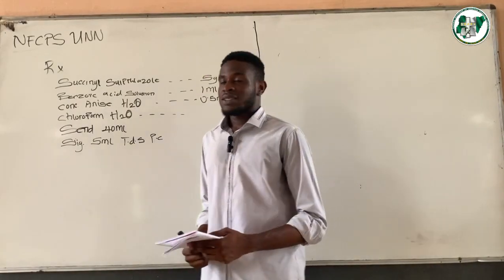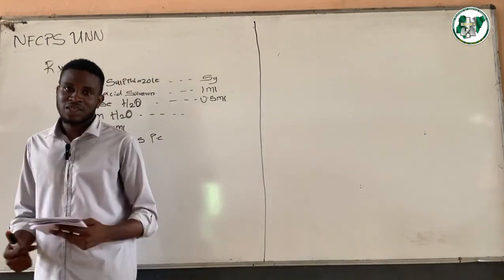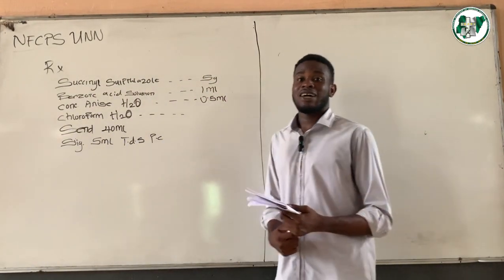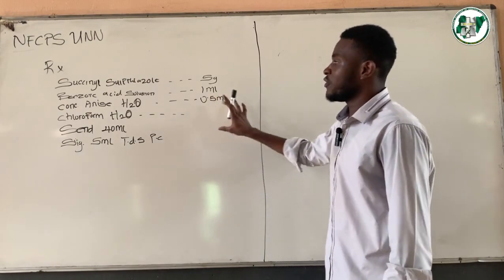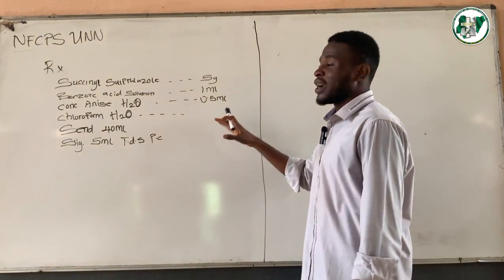Okay, over to this next question. Before going into it, I really want to bring to your attention that once you get to the lab, you will not necessarily have the luxury of time to be going over this as slowly as possible. If you look at this prescription, this is all you need for your label. You don't need the working formula after we might have solved to write your label.